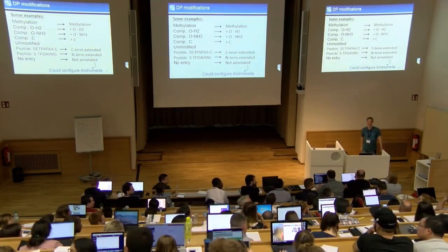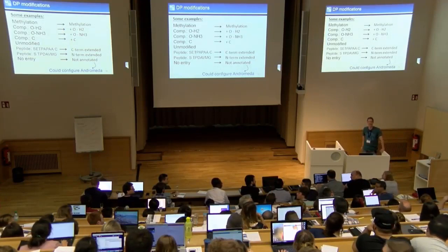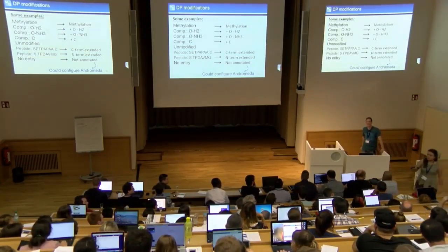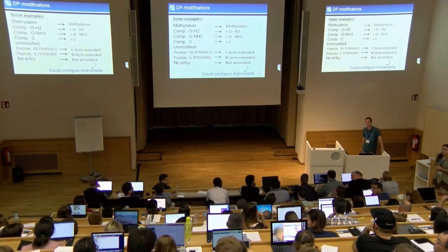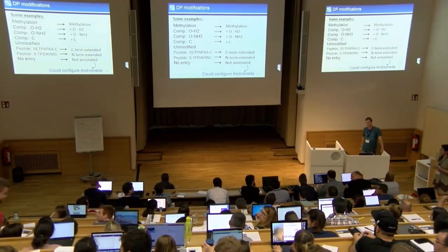In the current setting, all hypothetical modifications are permitted for the dependent peptide. Wouldn't it make sense to exclude some very unusual peptides to limit the search, or to retrieve more peptides due to the FDR control?